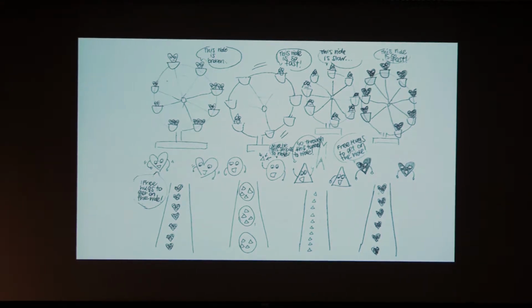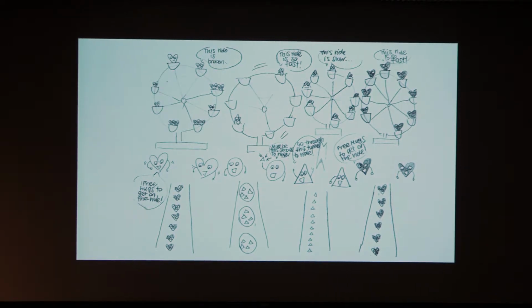So that ride is still fully functional, and the one with the bulk silver is also fully functional, because since the silver ions enter so slowly, it doesn't have enough of a harmful effect on the cells. And then the pure silver ions are kind of in between, where they had a negative effect on the cells as the carbon dioxide went down, but not as much as the nanoparticles. So it says this ride is slow. It's not killing all of them, but killing a large portion of them.